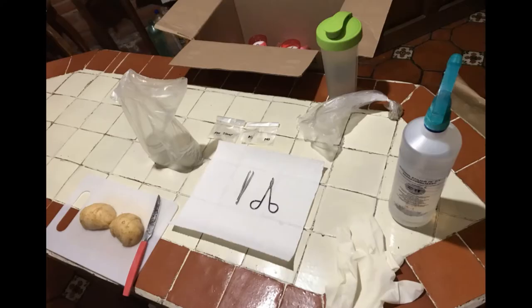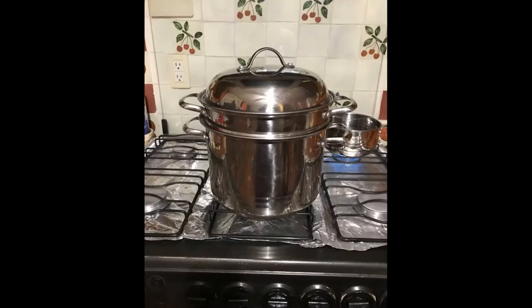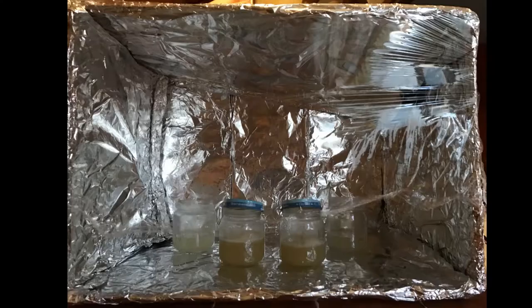And for the medium, I used a homemade medium and the MS media that I got from the lab. The first step was the sterilization. As an autoclave, I used a hot dog pot. I left the materials inside for 25 minutes at 130 degrees. The lentils were sterilized, taking 10 minutes in alcohol and 2 minutes in nano-pure water.